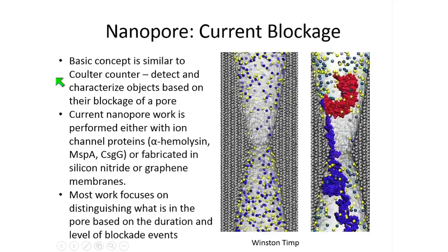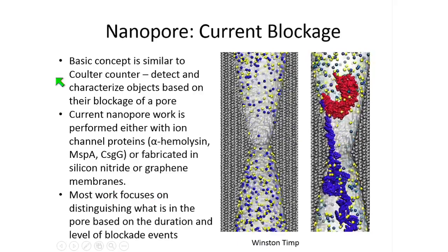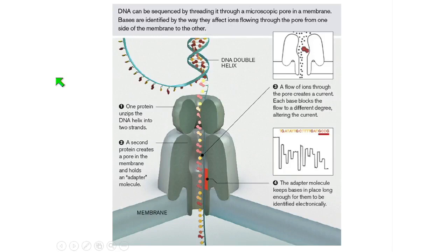And so the trick is to make that happen in a way that you can actually use in your lab. One of the issues if you're trying to do nanopore sequencing is that those DNA templates will go through the pore incredibly rapidly, in a millionth of a second, unless you can somehow control their movement. So much of the academic nanopore work has been on trying to find a way of restricting the movement of that DNA so that it can go through slowly enough to be detected. That's done with what's called, in nanopore terms, the motor protein, which is probably some sort of DNA helicase.